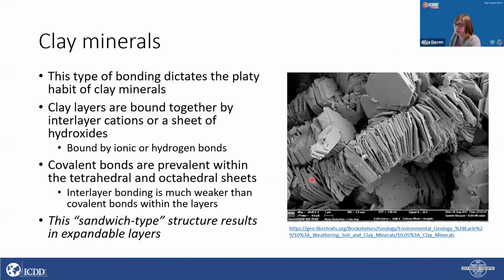So as I mentioned, clay minerals are platy. This is a really cool photo that I found. This is kaolinite. You can see how it's stacked. It has this hexagonal habit. And this is an SEM micrograph of kaolinite. So the bonding that I explained is what is responsible for the platy habit of clay minerals.